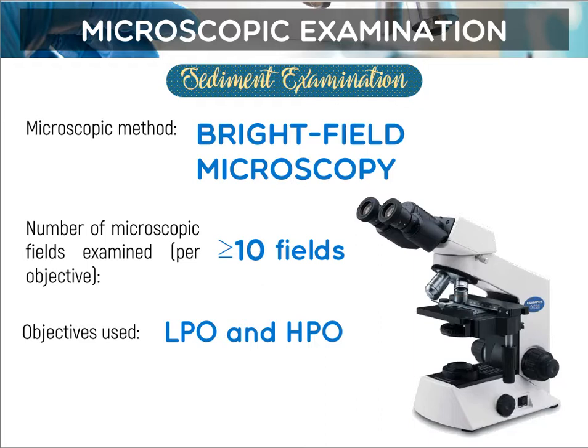Okay, so one thing about cast is they tend to locate near the edges of the cover slip. So, pag butang ninyo sa urine, dapat scan ninyo, lantaw mo sa edges if naa bay presence of cast, okay? So, sometimes if limpyo ra kayo ang urine, we usually have a hard time focusing kung sakto ba ni na field akong gilantaw. So, one thing you can do is use an epithelial cell as your point of reference, okay? When you are having trouble focusing, use epithelial cell.